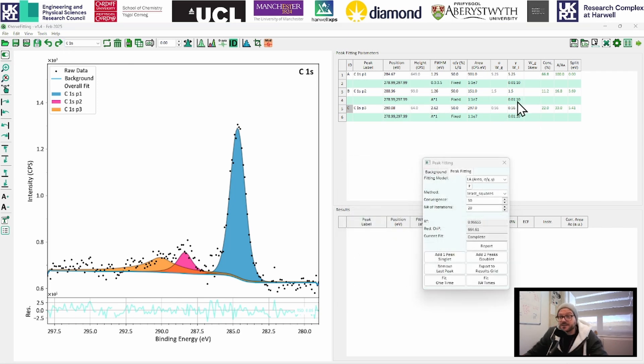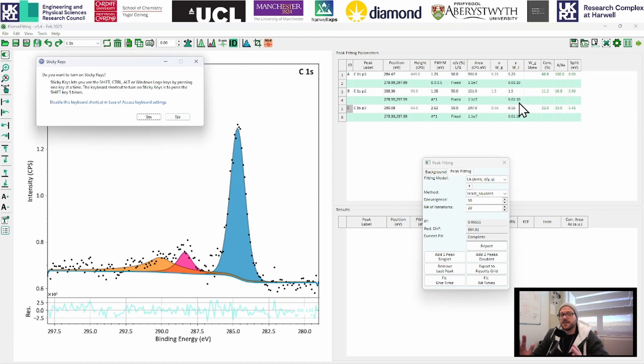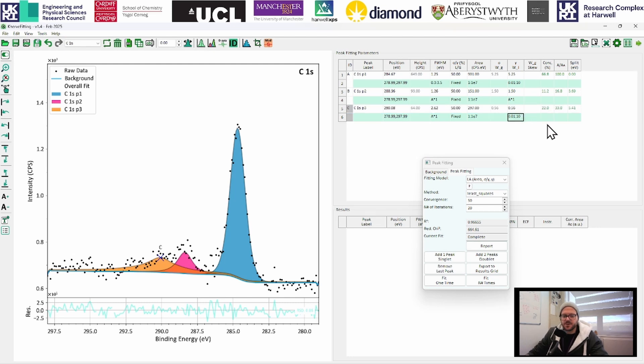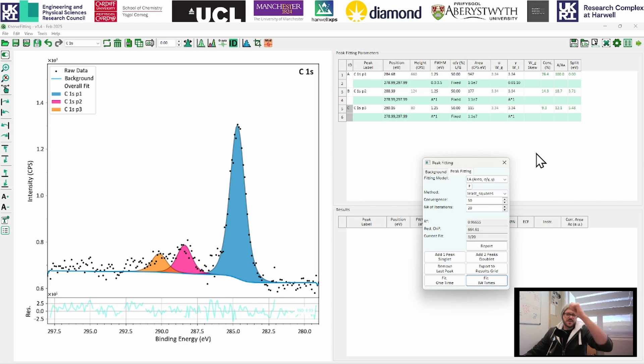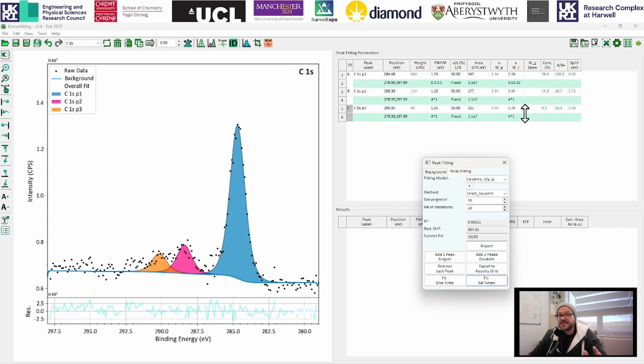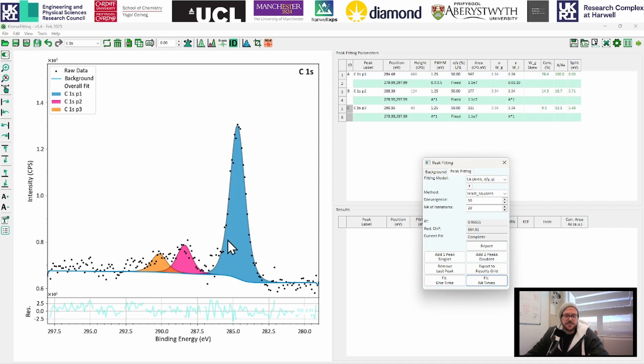So we're going to do the same thing in this column here. So this is going to lock the line shape parameter, the line shape parameters to be equal across the components. So A times one, A times one. Now, if we click fit again, what we can hopefully see is that our peaks that we've put in now look all the same. We've got the same parameters up here. And we now have a consistent fit for our CCCH and then some oxidated carbon species here.